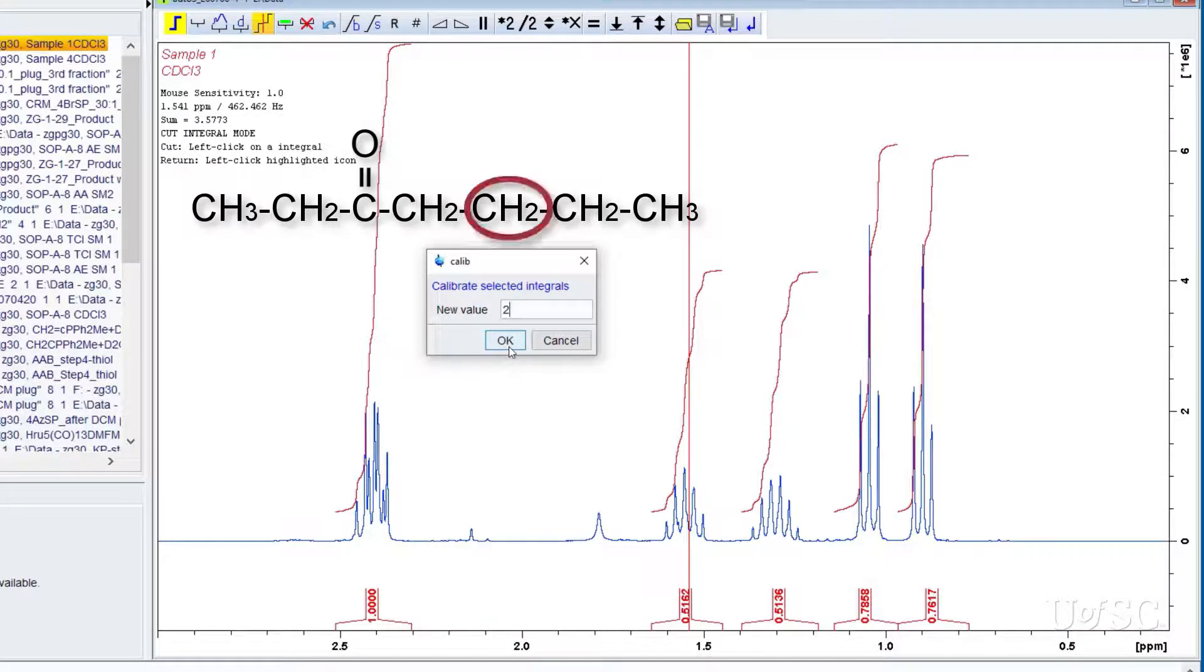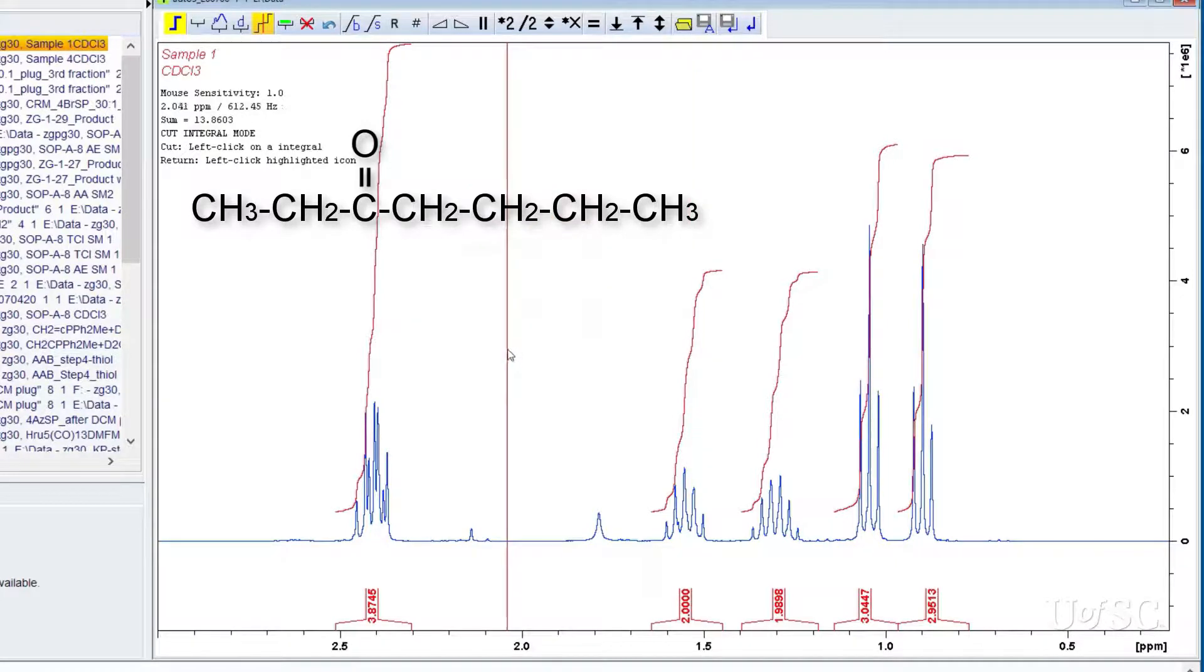In this case this is a peak from a methylene proton so I will set it to 2. Click OK. All the integrals should change to be in proportion with the calibrated region.